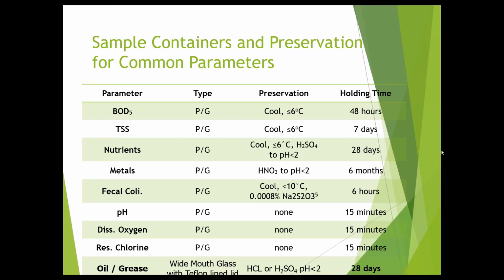Use a wide mouth. The mouth should be the width or near the width of the entire jar. And usually we use a 1 liter glass bottle. So that's a pretty wide mouth. You should be able to stick your fingers in or touch the bottom of it as a rule of thumb.